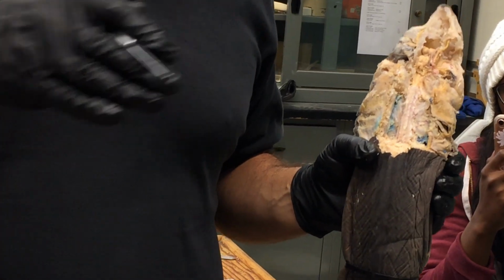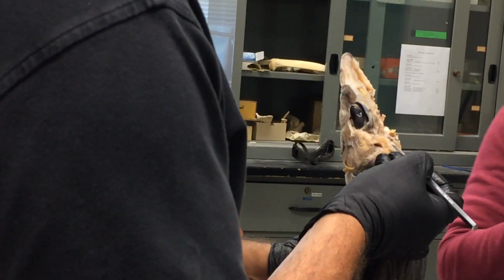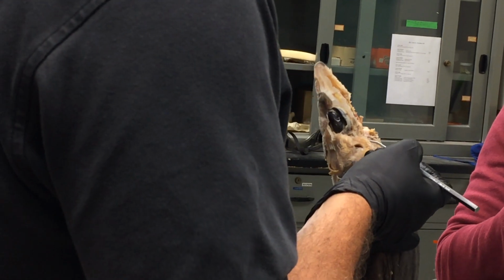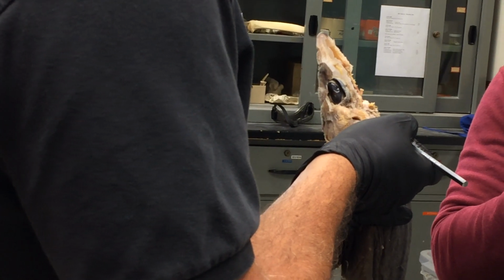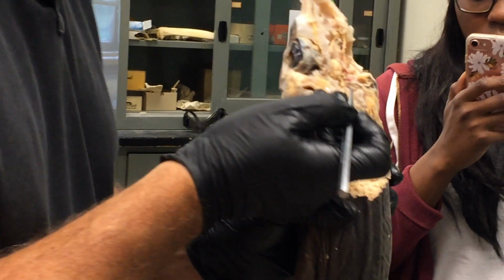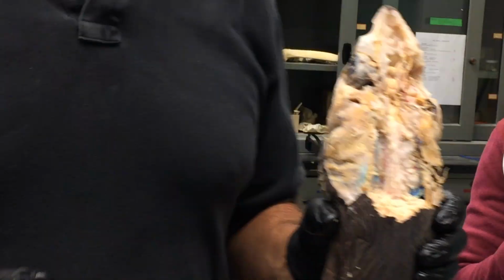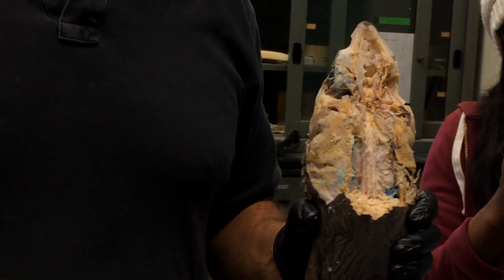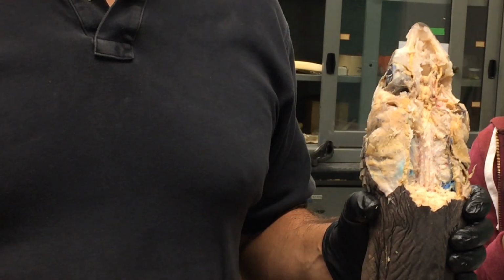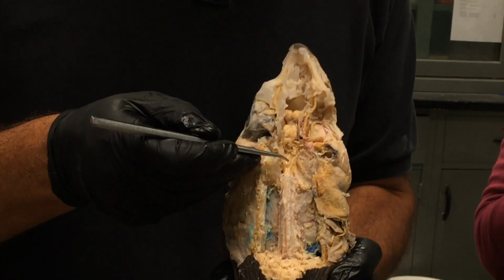And there's a roof over it that's been removed, the tela choroidea of the fourth ventricle, that covered it over. So we're seeing now into that space in the fourth ventricle. And what I want you to notice is there's these ridges that run along the bottom of the floor of the fourth ventricle there. Do you see that? Was it removed from dissecting or like evolution? No, it was there. It's very, very thin. It tends just to tear and go away on its own. But no, not evolution. It was there at some point.